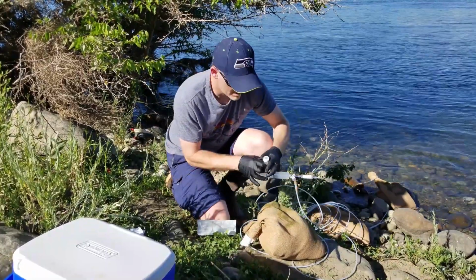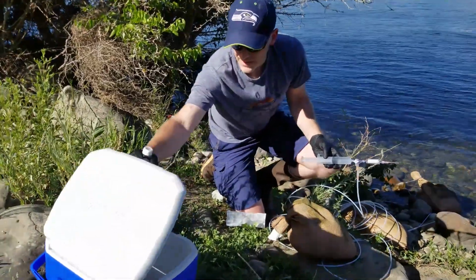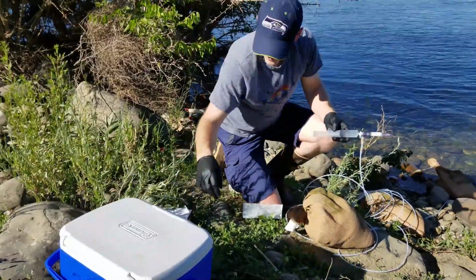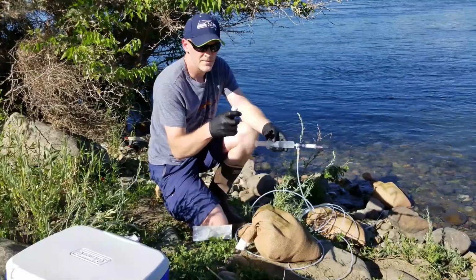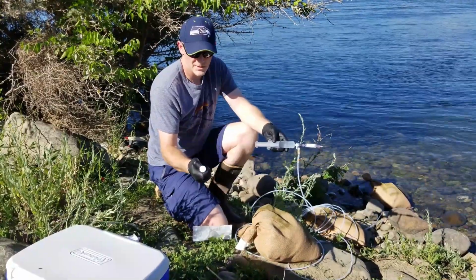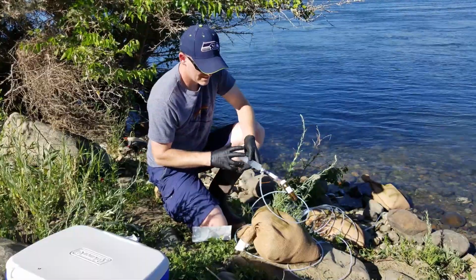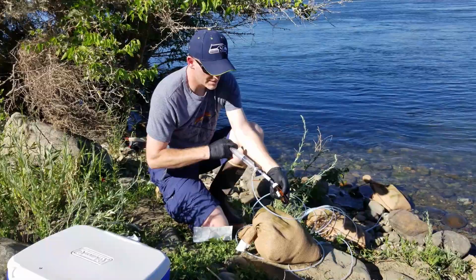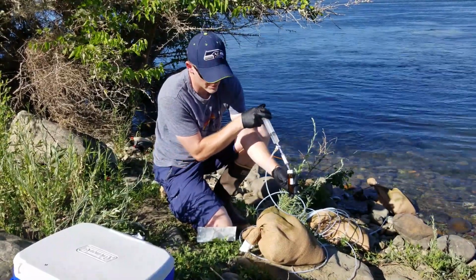Sample then, make sure you don't set this down in the dirt, but take the sample and place it in a cooler of wet or blue ice. Next thing you want to do is find an amber vial, and same procedure. You're going to pop the top, needle goes in, you're going to push in about 20 mils, so it's about halfway full. It's better to go a little bit less than half than over half.